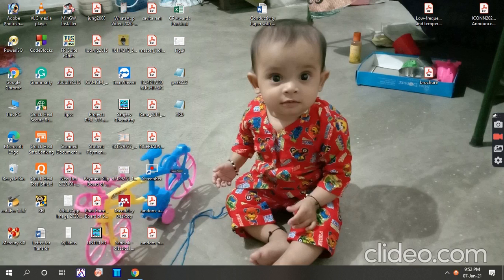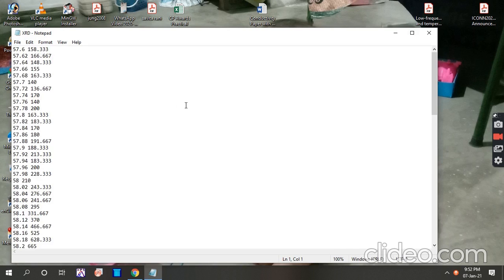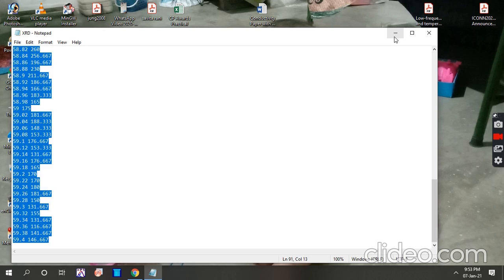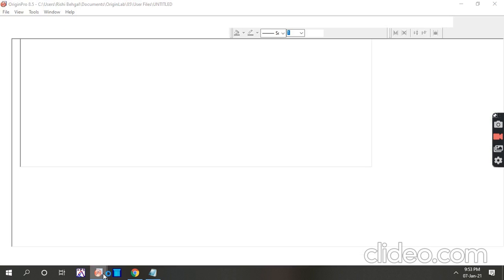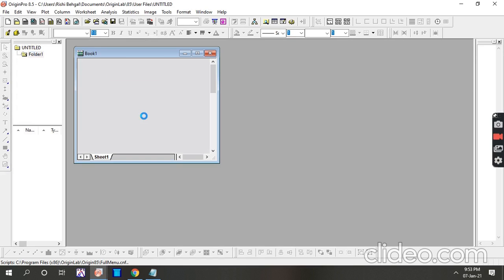Hello friends, today I will show you how to calculate the full width half maxima of an XRD peak using XRD data. For this, we have XRD data generally given by the instrument, available in a text file. We have selected Origin software to calculate the full width half maxima of the XRD peak.